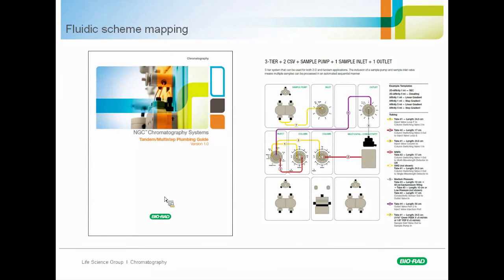Now, I did this many times in a former life before I joined Bio-Rad, and the top traditional workflow is the one I've done many, many times. With this, you load your sample onto a protein A column, you would elute from the protein A column in an acidic buffer, you then neutralize the fractions to avoid denaturing the antibody. This would then need to be diluted into a different buffer to make it compatible with the next column, which would then be the ion exchange column.